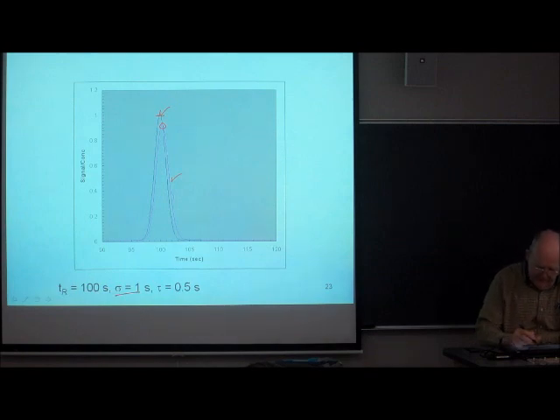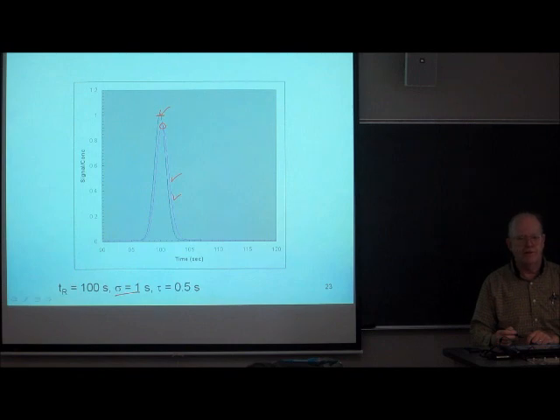And this peak is shifted. It's at a slightly longer time than the underlying Gaussian. And in fact, it's a little tiny bit asymmetric. What's not obvious is that the area under this signal is identical to the area under the parent Gaussian. I absolutely guarantee that. A filter does not destroy signal. It must come out. What goes in comes out.